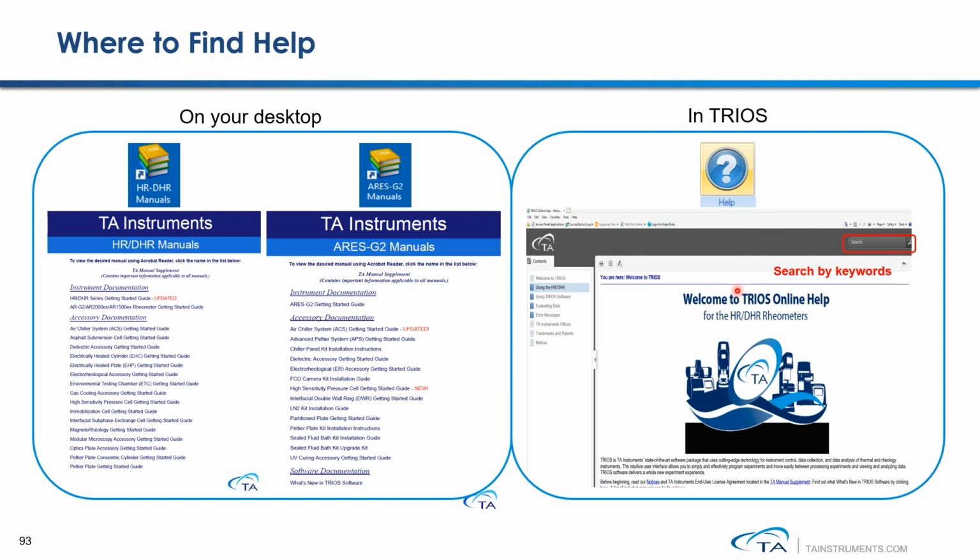Using this online help, you can find a lot of related topics regarding how to set up experiments and how to use a specific geometry. For a quick search, you can simply type in some keywords to get to the topics that you are interested in.